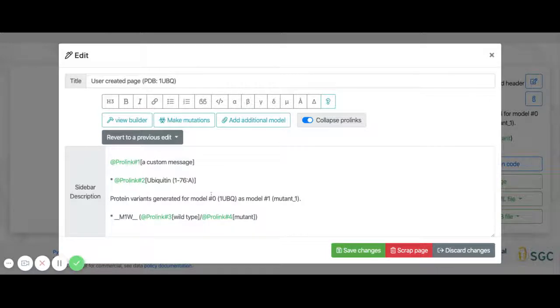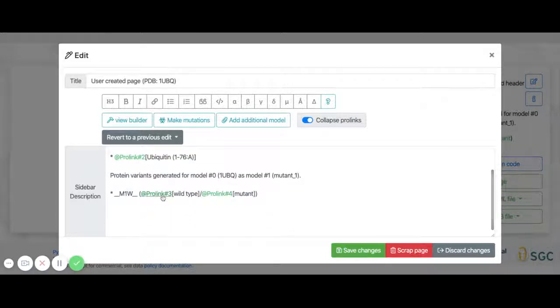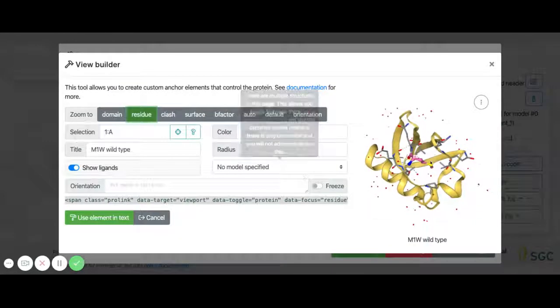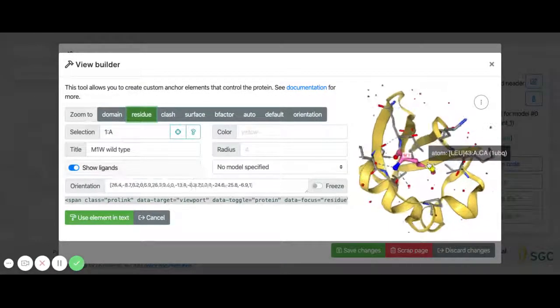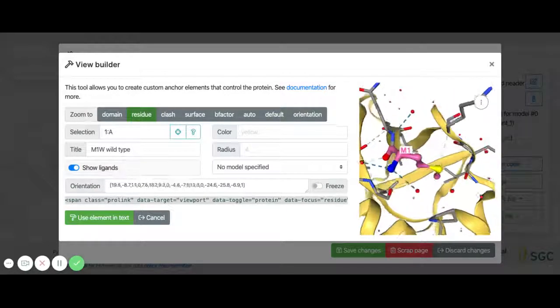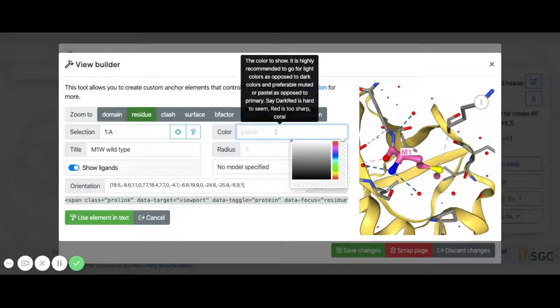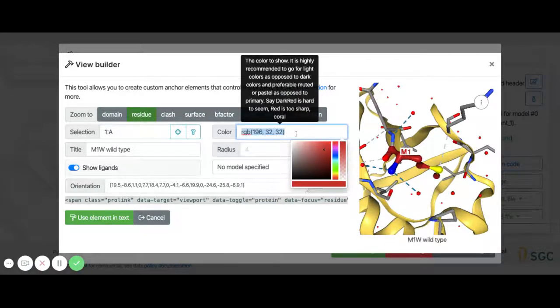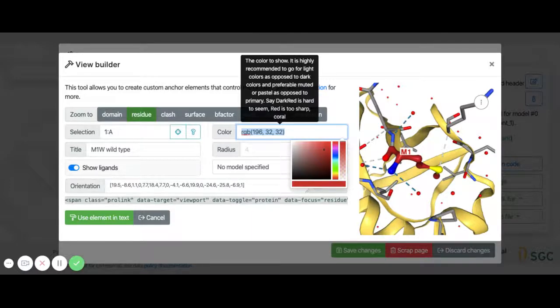So let's say that this link, I don't quite like it. Let's change it. So currently it's been loaded and we can go and edit it. Let's zoom in, change this hot pink to, say, any color that we can think of by picking either here or by typing a common HTML color name, which is generally most colors you can think of except unusual ones, plus mustard.